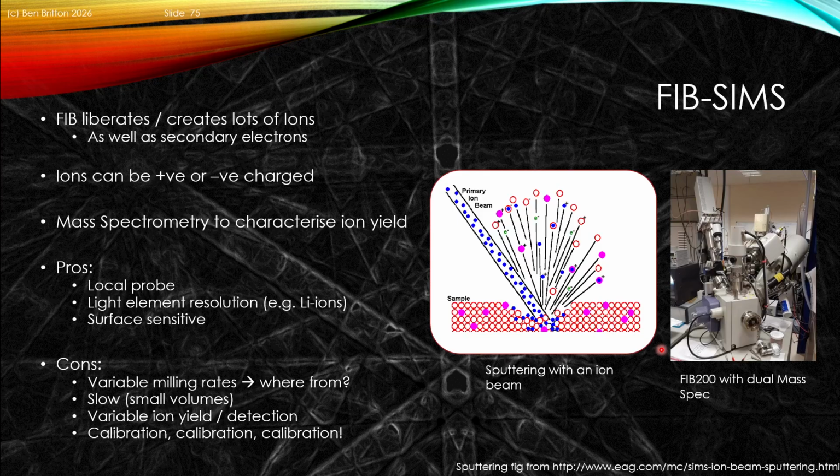This is also a good point to say, with regards to the beam, we can use the beam and collect the ions. This is an example of a system based at, I can't remember where it's based, I think probably Imperial College is where this photo is from. Maybe not in this, but here we effectively can put a SIMS instrument. This is a SIMS instrument, a secondary ion mass spectrometer, which can collect and work out what the ion species are in the sputtered cloud.